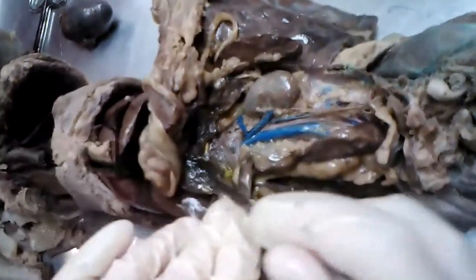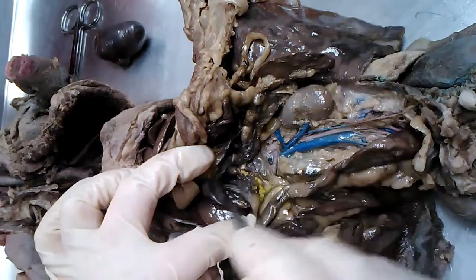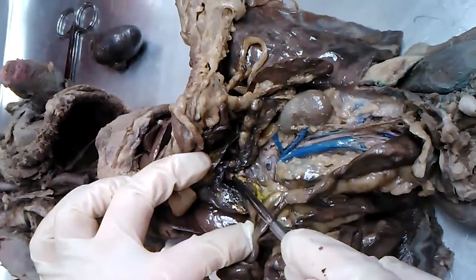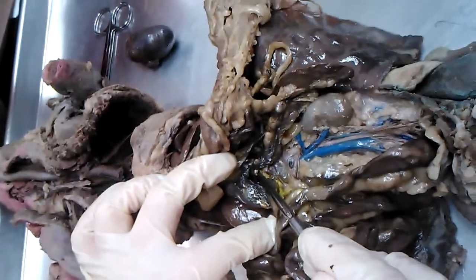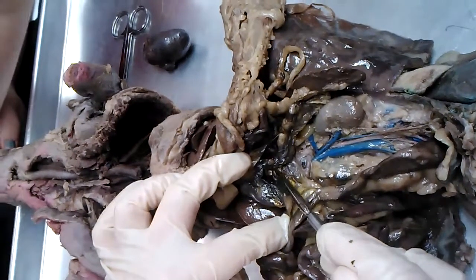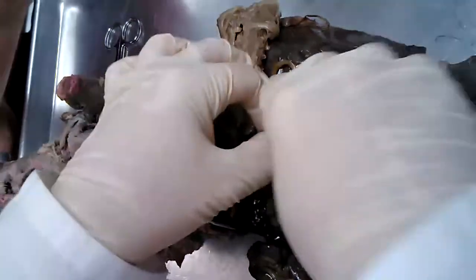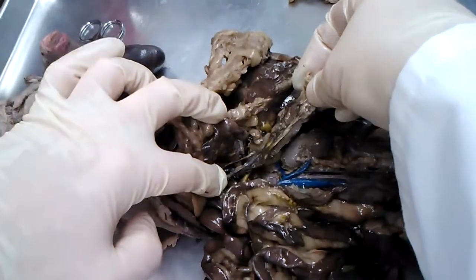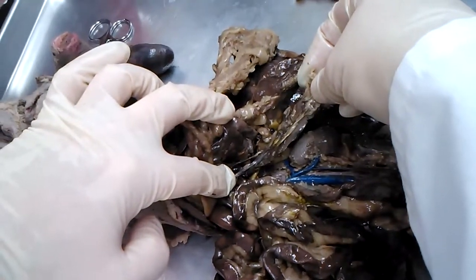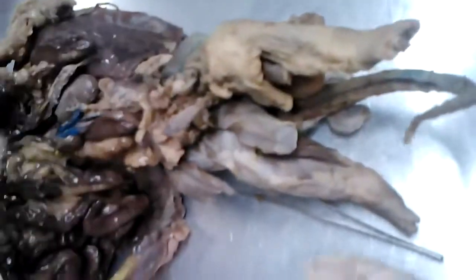Then we have this big yellow structure up here too as well, don't forget that. This big yellow vein here, this is the hepatic portal vein, or you can call it the portal vein, just don't call it the hepatic vein. So either hepatic portal or portal vein. And then the structure I'm holding right now in my hand, long and kind of black, that's the pancreas. Another nice organ we find down here. So that's pancreas.